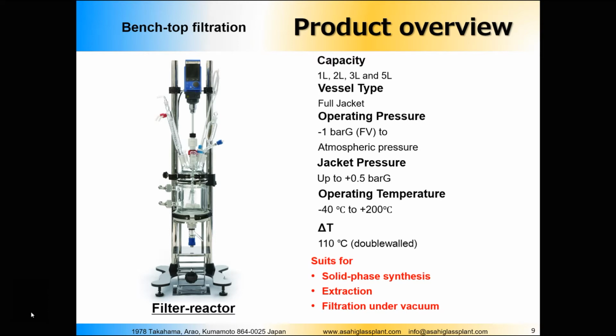Why? Because if we're talking about a synthesis that needs filtration afterwards, it means that some kind of process occurs in the reactor, and we will get some solids after the reaction. Or we use, for example, solid catalysts.